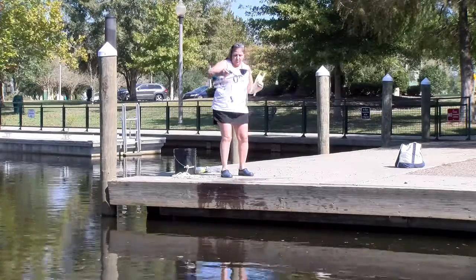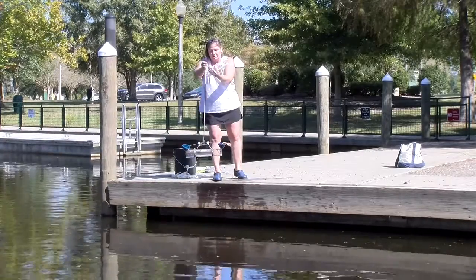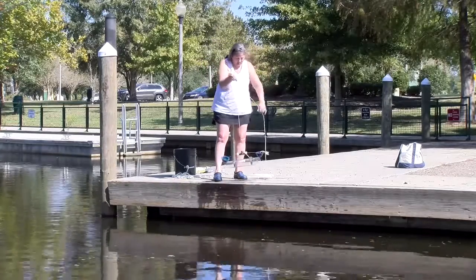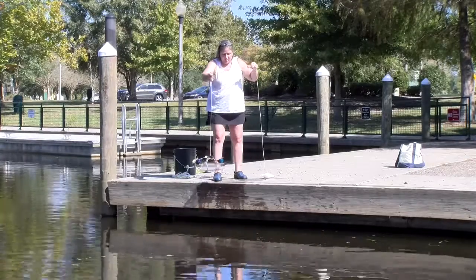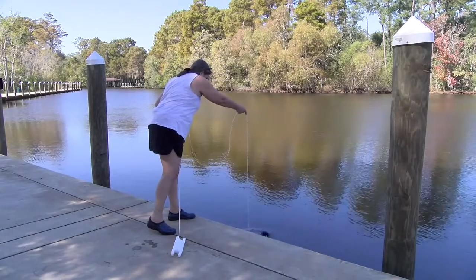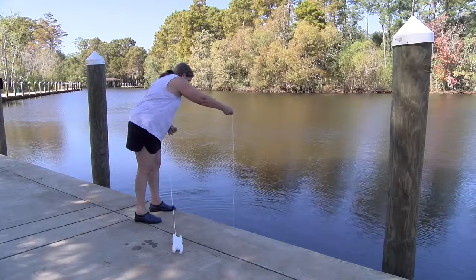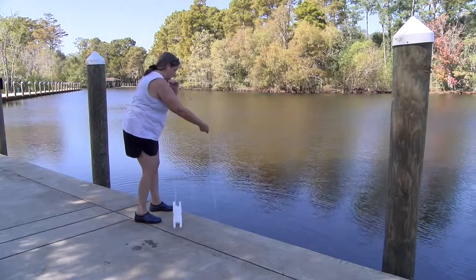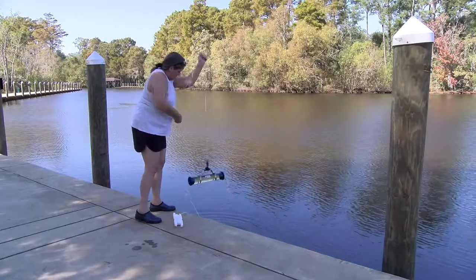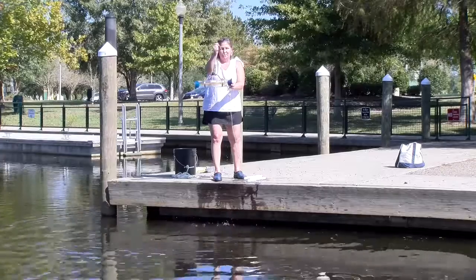And then at your predetermined depth, you'll lower the Van Dorn down into the water, holding the messenger in your hand so that it won't trip your wires. And you look at the measurements on your line and you drop it to the level that you want to take the measurement. And I'm going to do 2 feet. And then I will send the messenger down the line. It'll trip the little suction cups on either side, and you have a water sample.